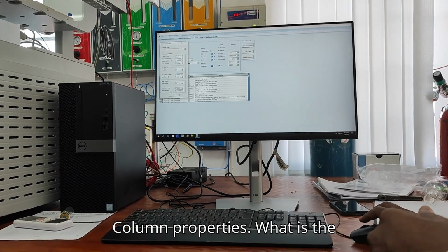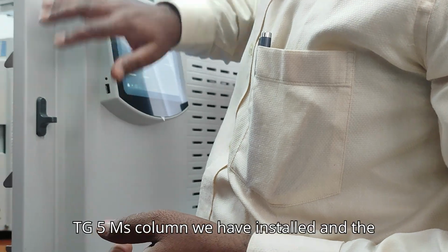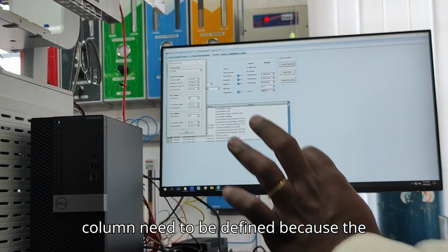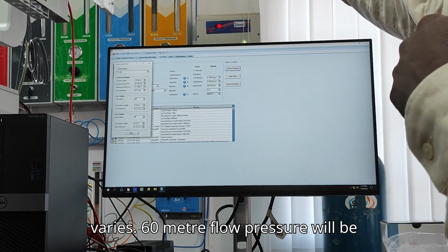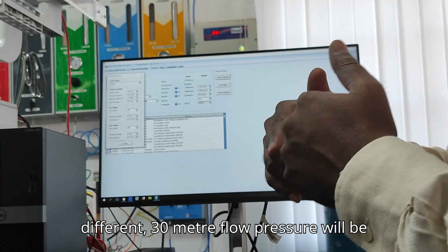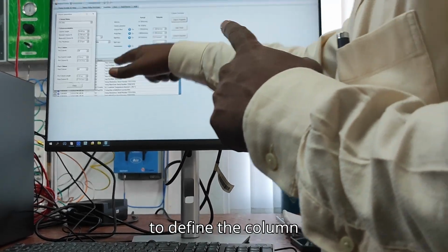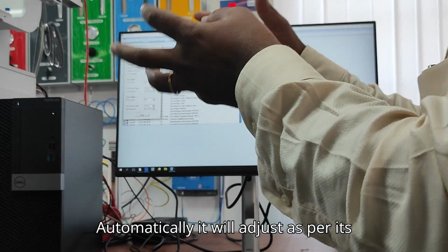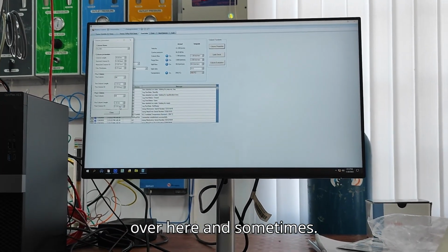Now column properties. What is the column we have installed on the system? This is the column we have installed, TG-5MS column, right? You can see the TG-5MS column we have installed, and the dimension of the column. The dimension of the column needs to be defined because the column flow and pressure should be adjusted accordingly. Because if the length varies, 60 meter, flow pressure will be different; 30 meter, flow pressure will be different; 0.32 and 0.53 flow pressure will be different. So accordingly we have to define the column specification, then the column flow automatically adjusts as per its pressure and temperature. So we have defined the column properties over here.